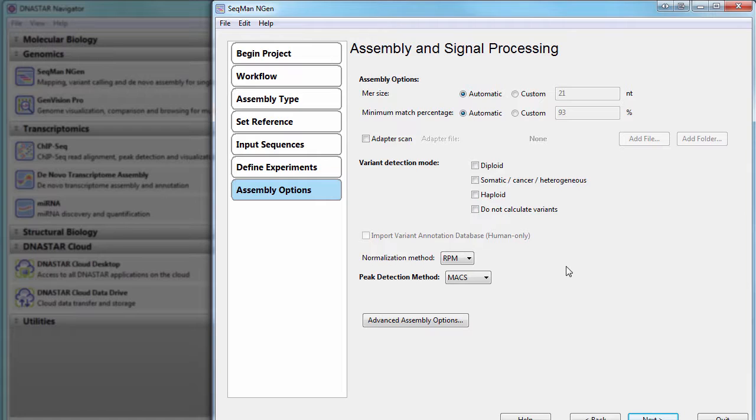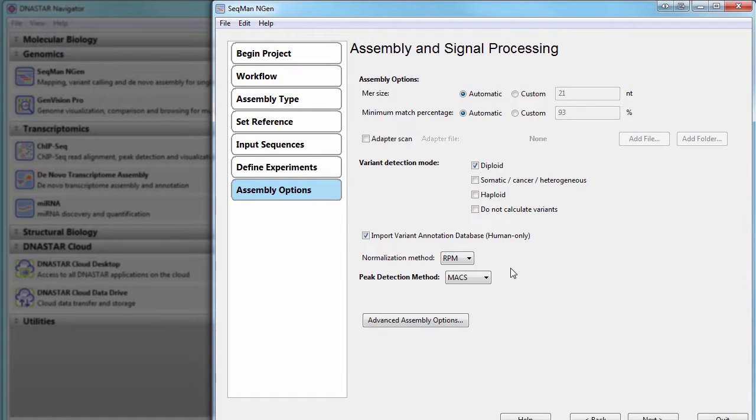Since we're working with human data, I'll select Diploid Variant Detection, and I'll also import the Variant Annotation database. I'm going to leave the Normalization and Peak Detection methods set to RPM and Max, respectively.